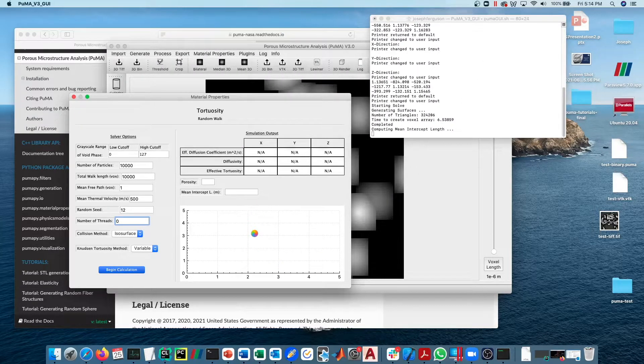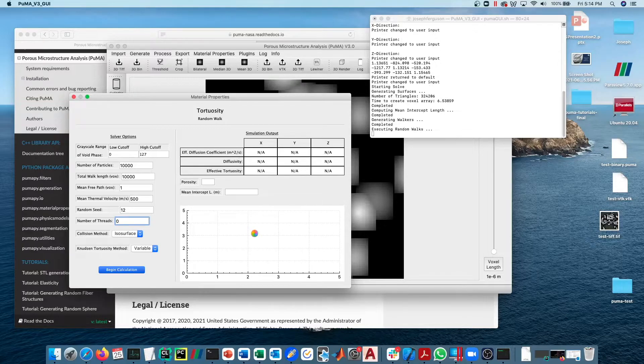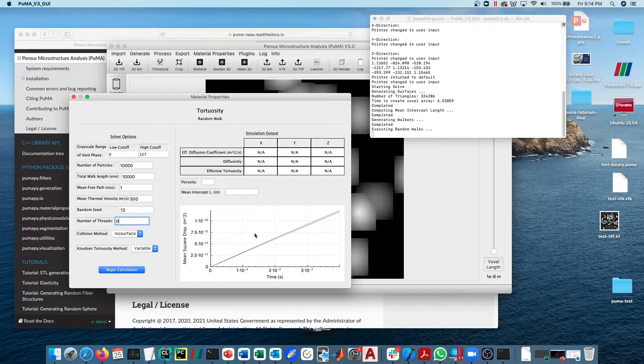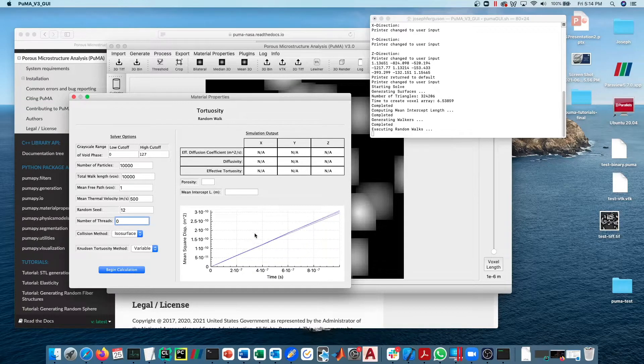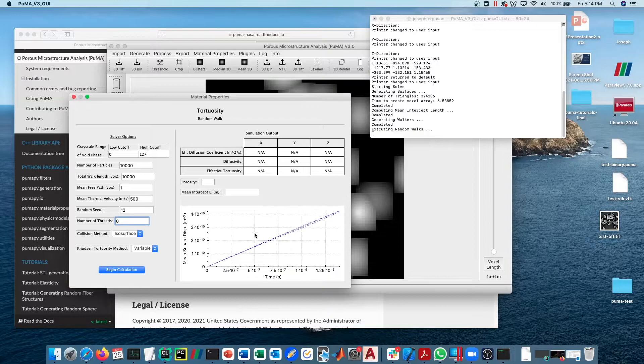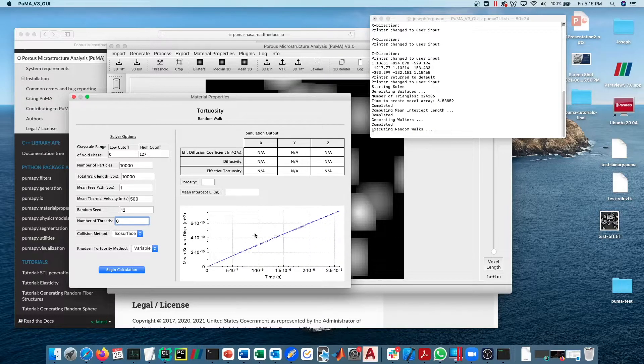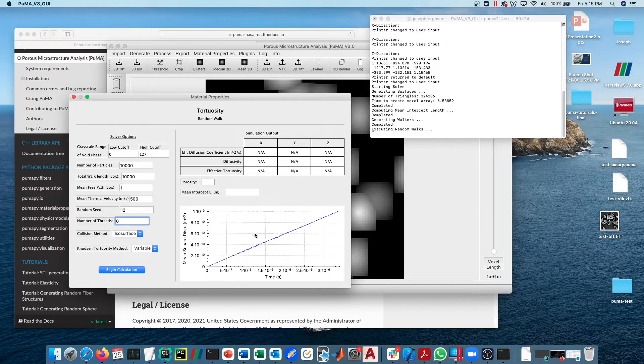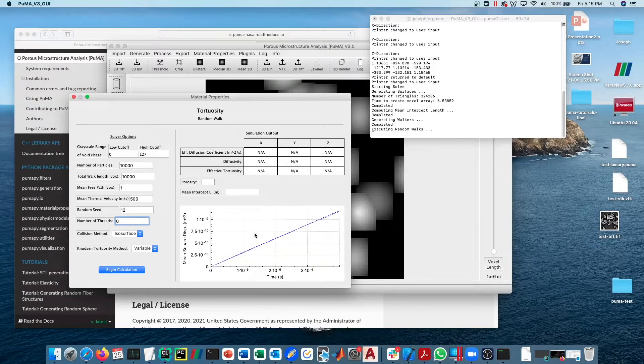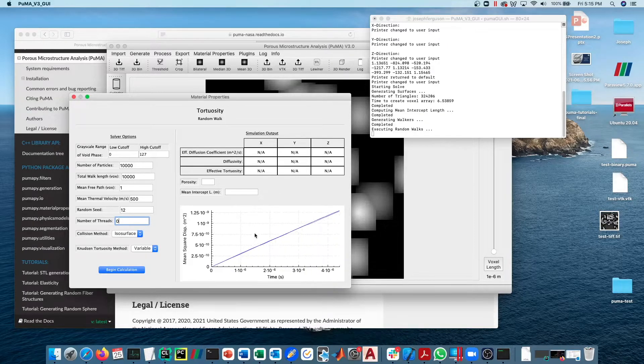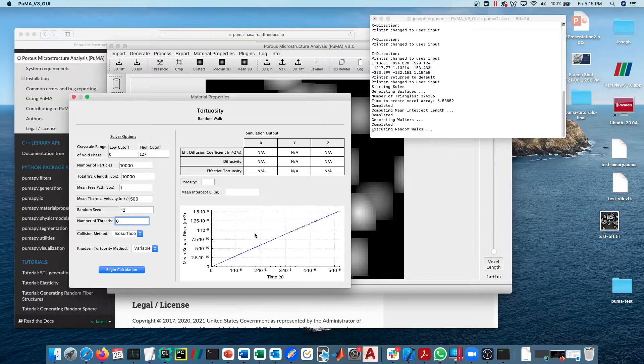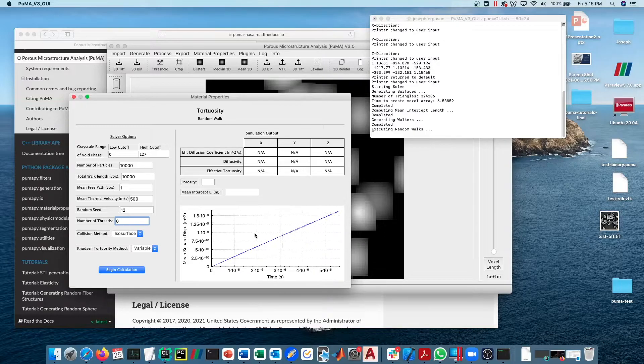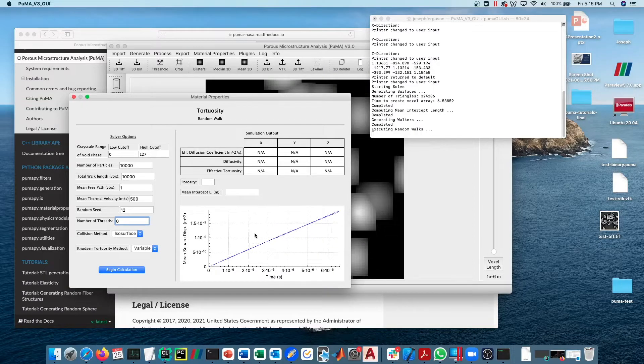If you look at the terminal that you're running on, you can see exactly what step is occurring. Right now it's executing the random walks. It will plot this plot of mean squared displacement as a function of time. The fact that this is linear here is good—that's what we want to see.